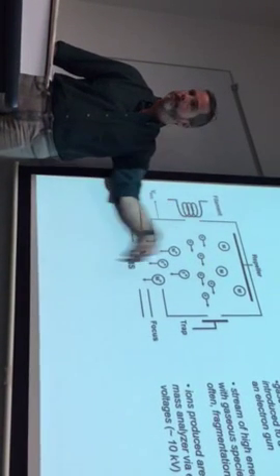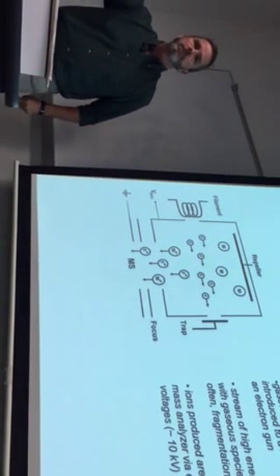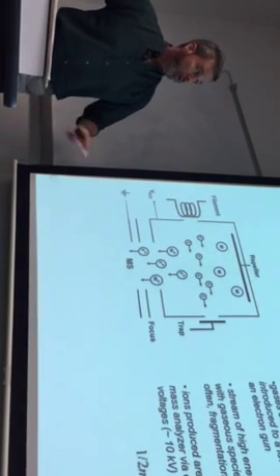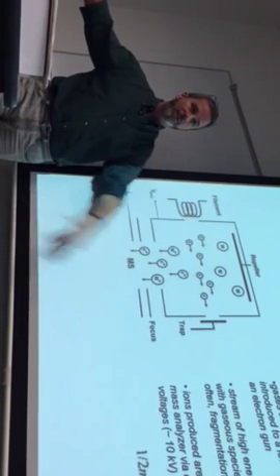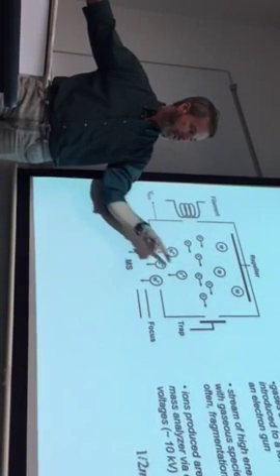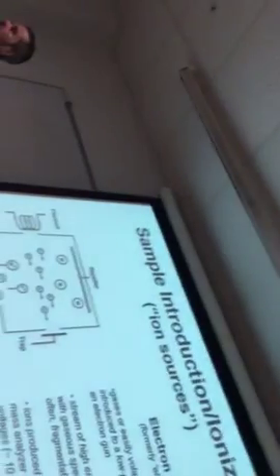And out they come, boom. Everybody good? So you have a stream of positive charges? Yeah, you are ejecting the gas phase cations that are formed, the intact molecules that have been ionized, and their fragments. So the cationic species are ejected.